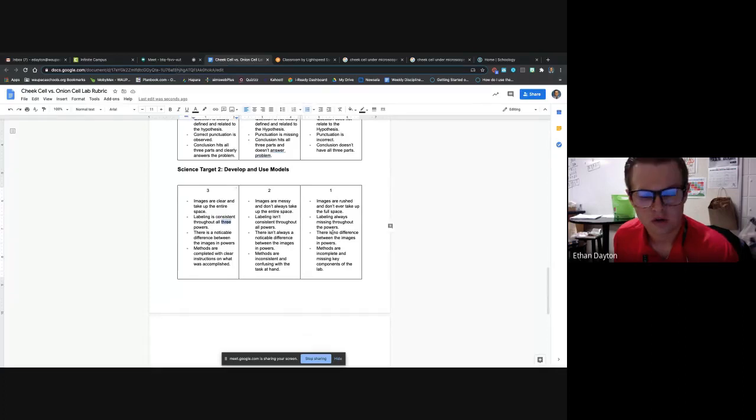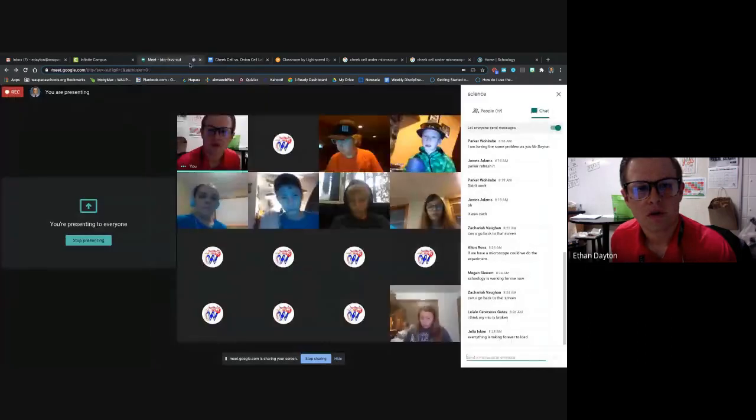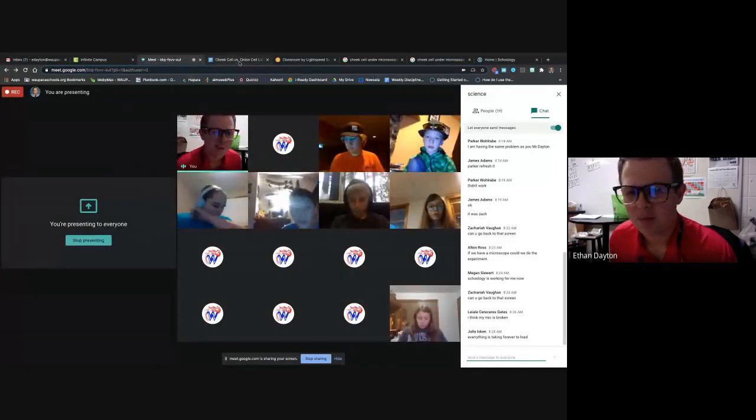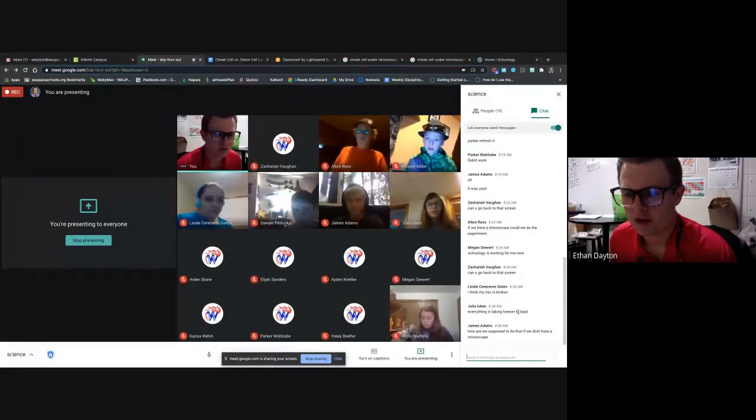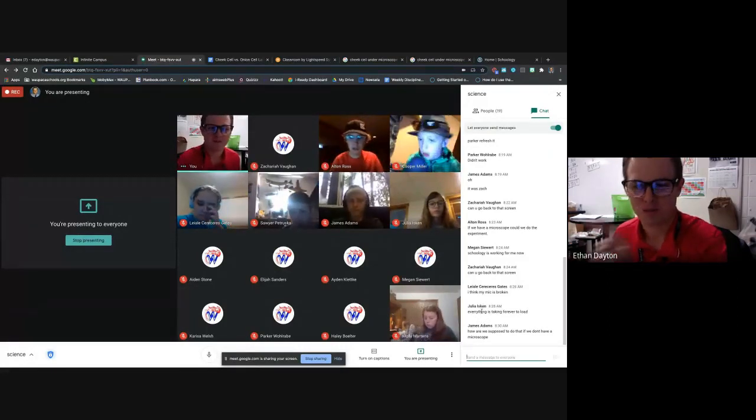We're going to do 2 powers because I'm not going into high power today. So, what do I need to label on a cell? What are the 3 main parts of a cell? James, we'll get to it. I have a microscope here. We'll get to it.